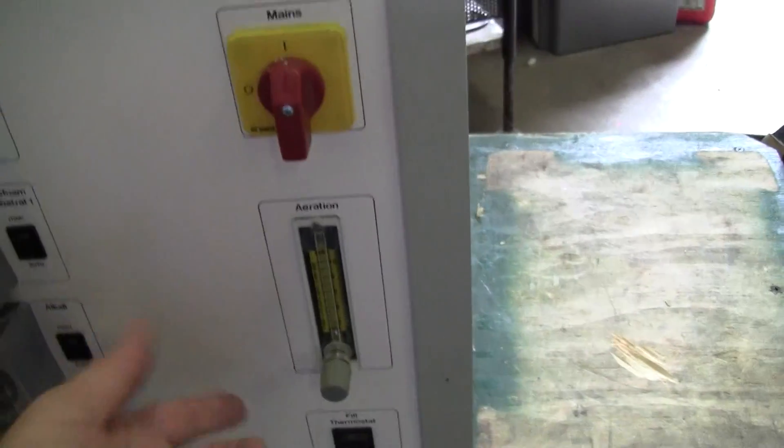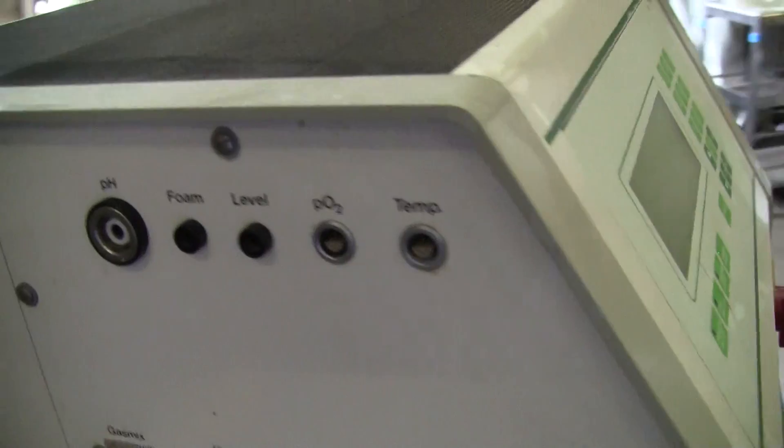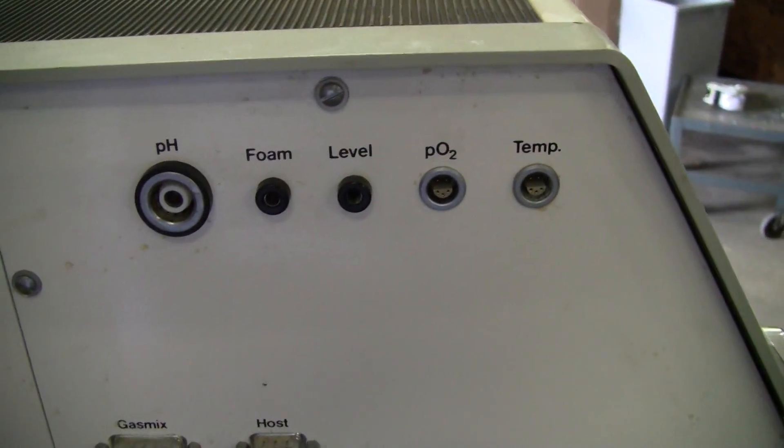Power on and off. Looking for pumping fluid on the sides. There's your temp. pH foam.